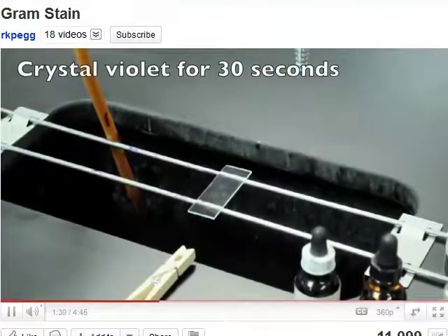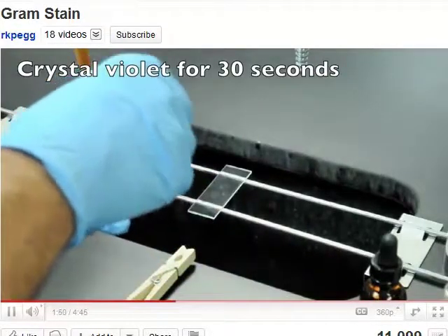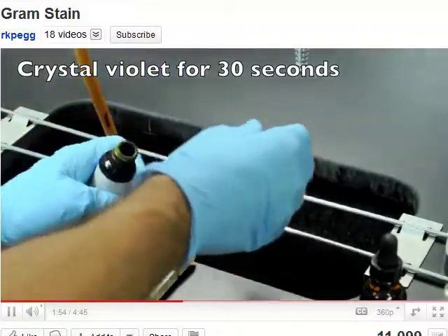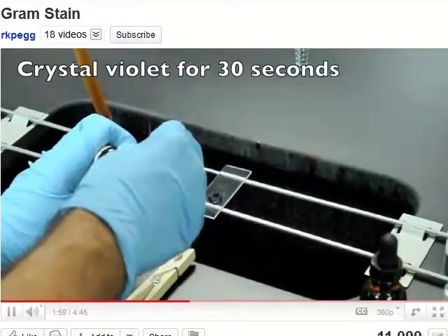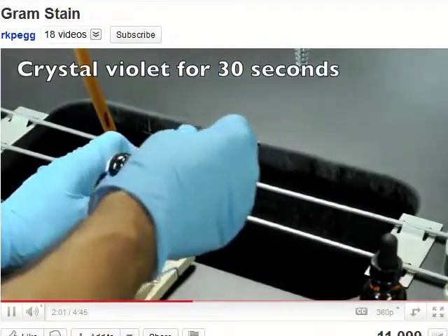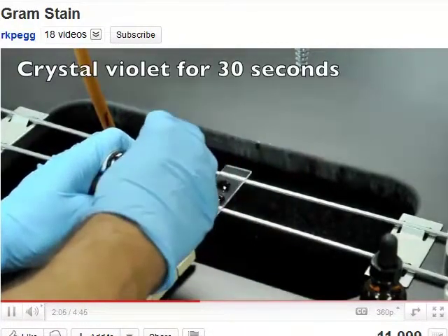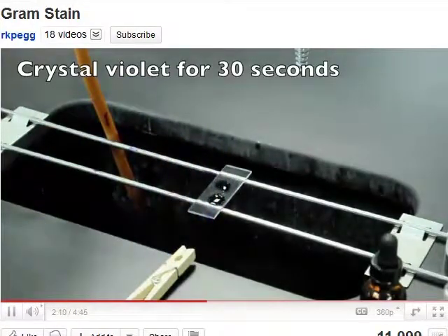Now, this is one example of how we might treat the slides. You can see the clothespin there, which is going to be used as an inexpensive slide holder. This particular rack, which is in the sinks in T231, is very good because we can flood and clean up fairly easily. Now we're applying the Gram crystal violet dye, and that's going to be for 30 seconds. So we're going to put 2 to 4 drops on each spot. We have an A and a B spot, so we're going to have 2 spots of the crystal violet stain. And then we'll count for 30 seconds.